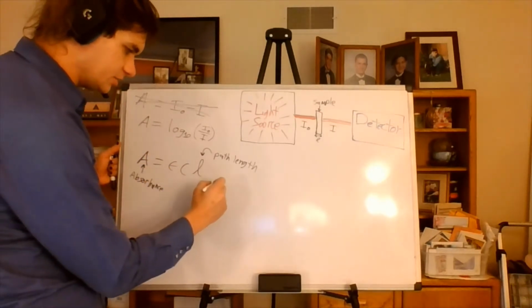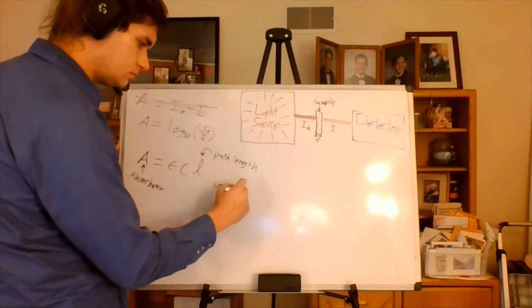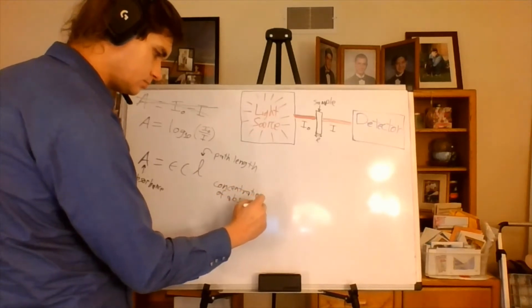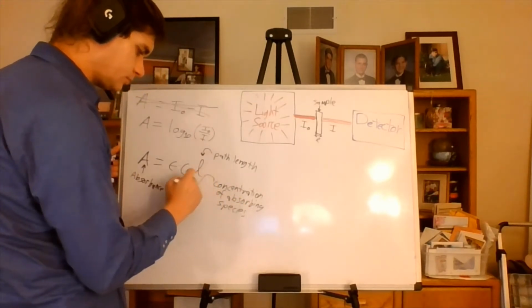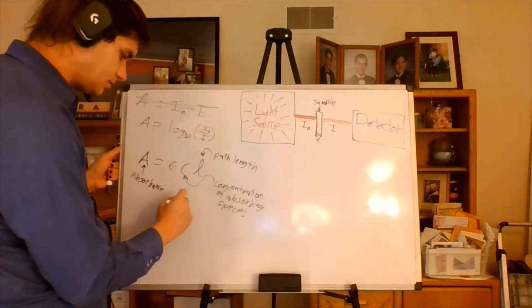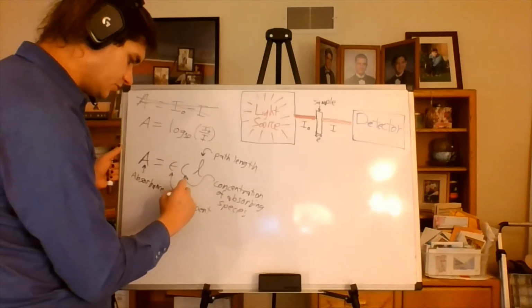This is the concentration of whatever is doing the absorbing, and this one, epsilon, is a coefficient, the absorption coefficient.